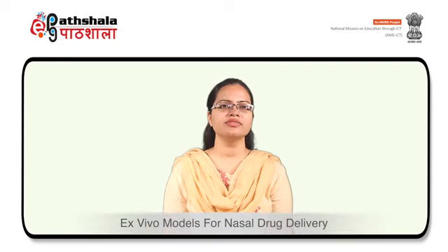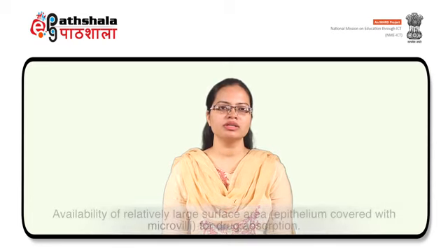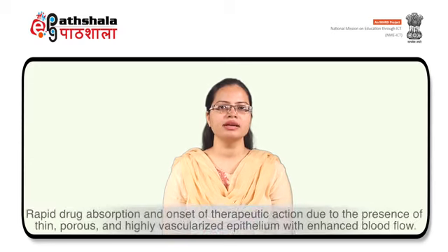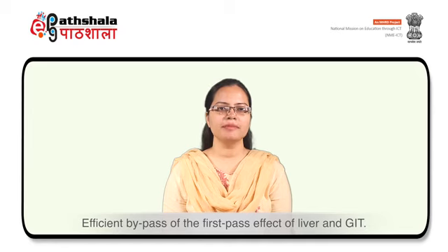Now we are going to discuss the different ex vivo models used in nasal drug delivery. Drug delivery using the nasal route is gaining wide acceptance within the pharmaceutical industry owing to the potential advantages associated with this system. These include, first, availability of relatively large surface area for drug absorption. Second, rapid drug absorption and onset of therapeutic action due to the presence of thin, porous and highly vascularized epithelium with enhanced blood flow. Third, direct delivery of absorbed drugs into systemic circulation. Fourth, efficient bypass of the first pass effect of liver and GIT.